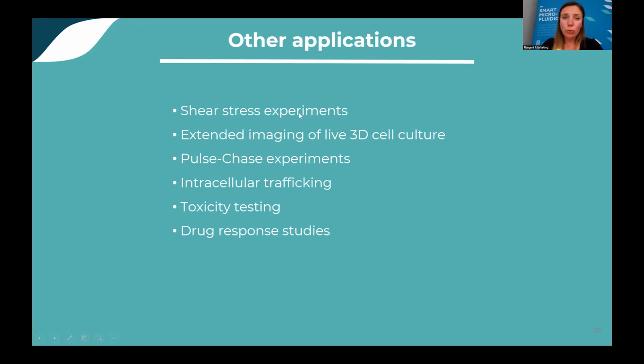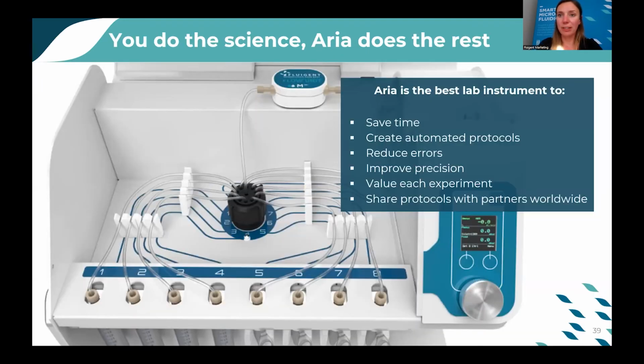It can also be used to automate pulse chase experiments for live cells. You inject a drug, you image the cell reaction, and perform washout and see how the cell resume its motility, for example. It can also be used for DNA paint, for super resolution. There are no limits in the application, actually. It's just a matter of setting.